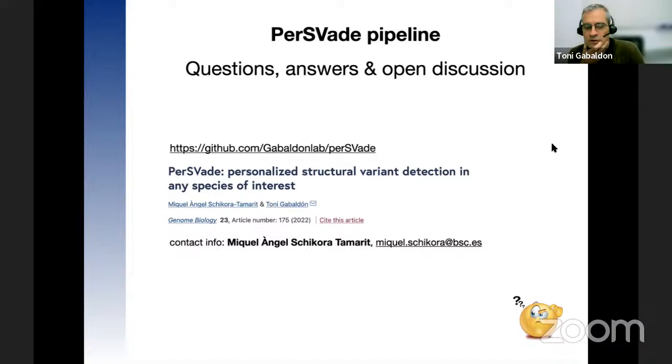Yes. So the next question, by Malin Hasselgren, is: is this pipeline also suitable for long reads? No, I'm sorry, but no. All of the filtering parameters and the underlying software are for short reads. So I don't think it would make sense to use it the same way for long reads. But maybe in the future we will be working on doing something similar for long reads.